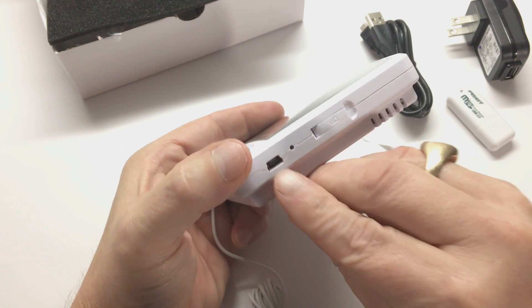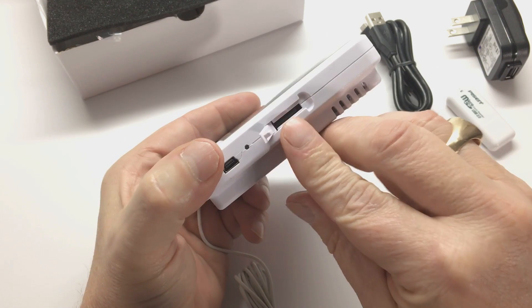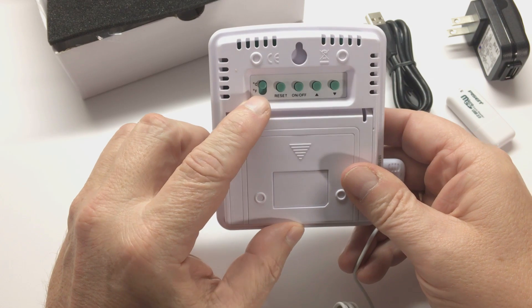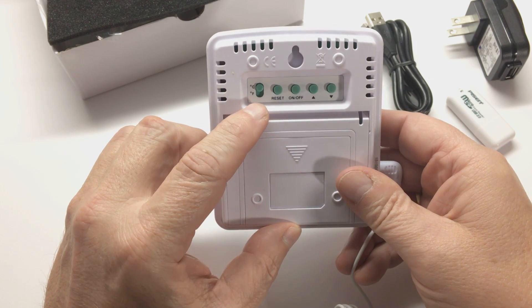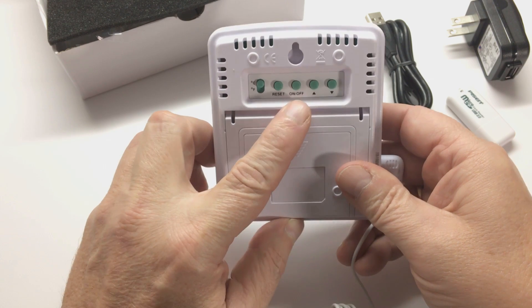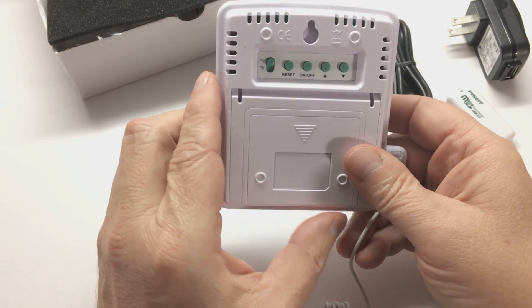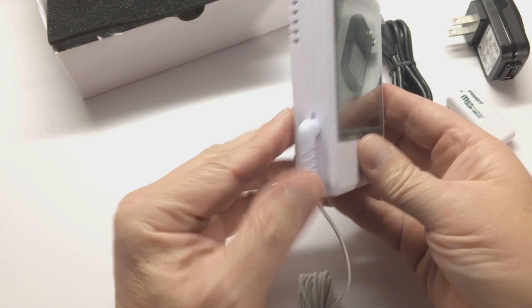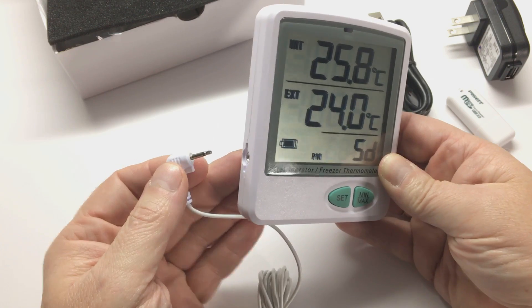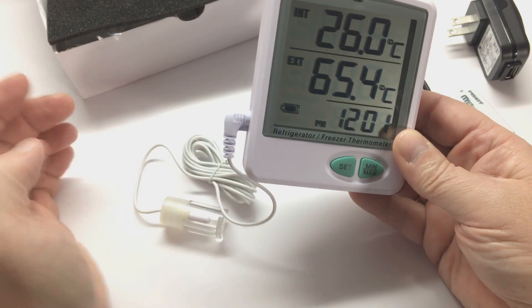On the side, you have your USB port and SD card slot. On the back, you have your C and F temperature scale selection switch, reset button which resets the unit back to factory settings, power on/off button, and your up and down buttons to scroll through the different settings. On the left-hand side, you have your 3.5mm jack for your removable probe, which is also required by CDC.